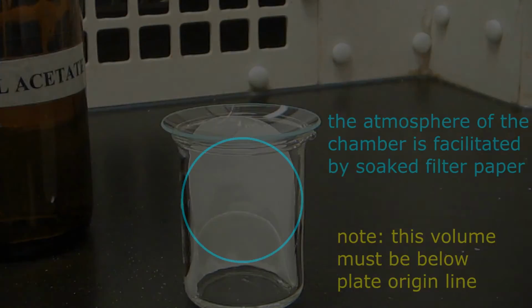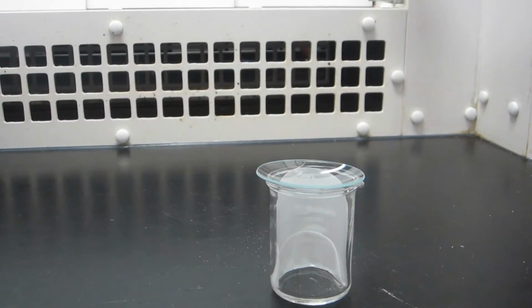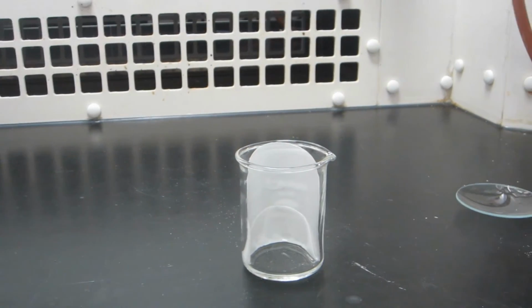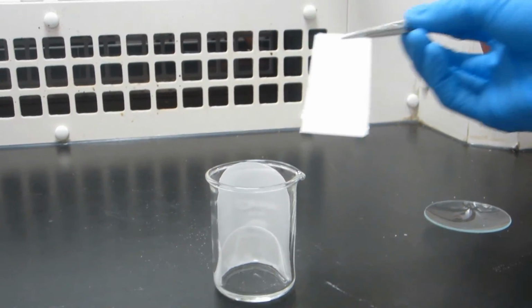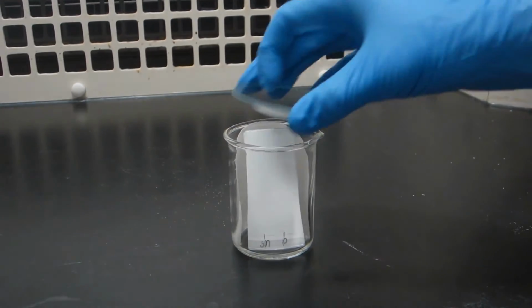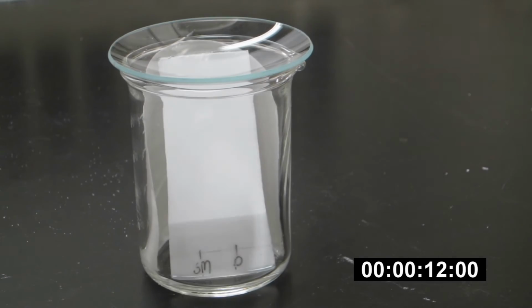and give inaccurate results. Using a pair of tweezers, place the plate inside the developing chamber with the origin line at the bottom. Be sure that the origin line remains above the solvent level. Immediately cover the chamber with a watch glass and allow the solvent to travel up the plate.